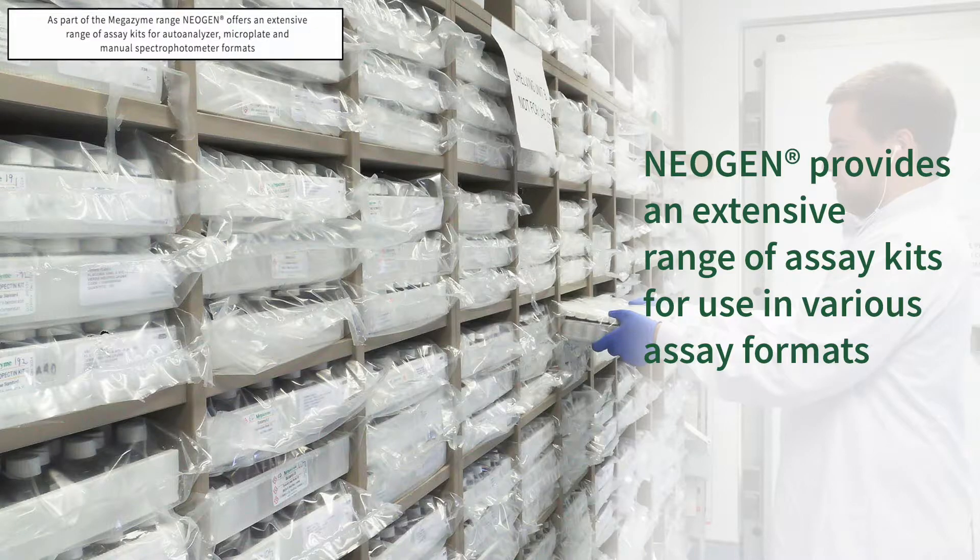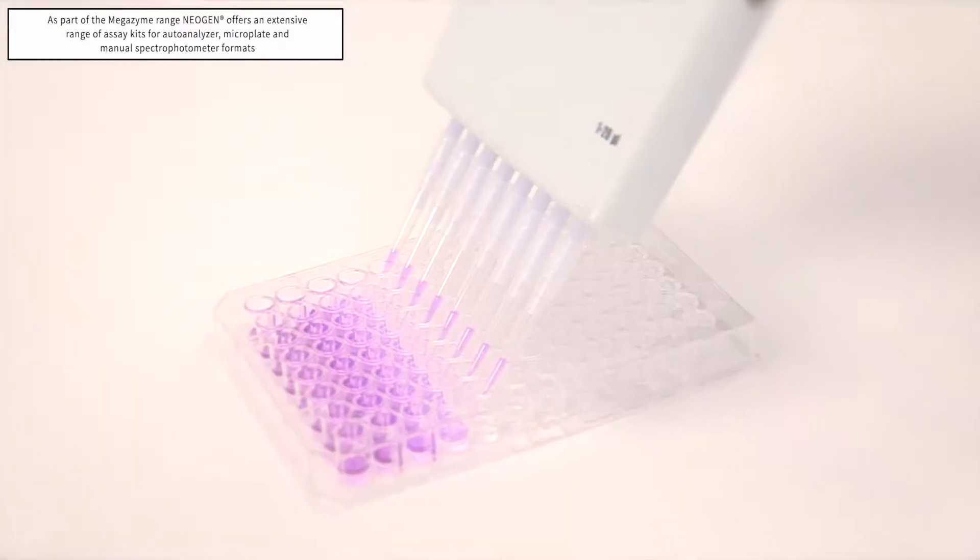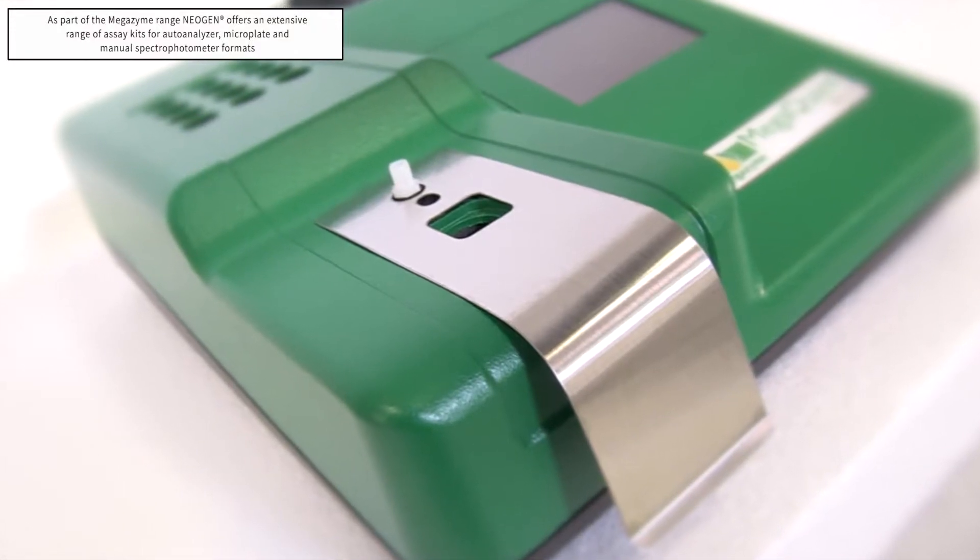As part of the Megazyme product range, Neogen provides an extensive range of assay kits for use in various assay formats, including Auto-Analyser, Microplate and Manual Spectrophotometer.